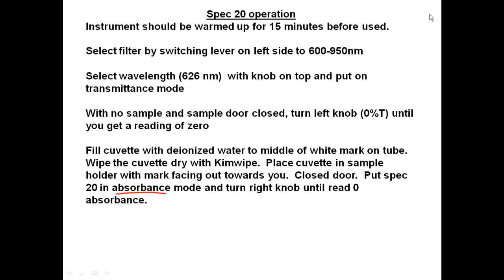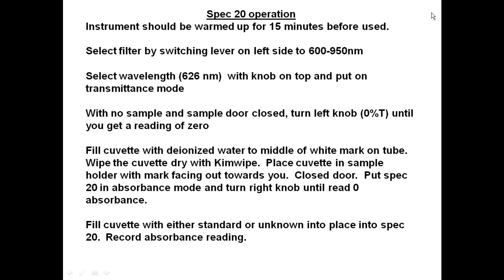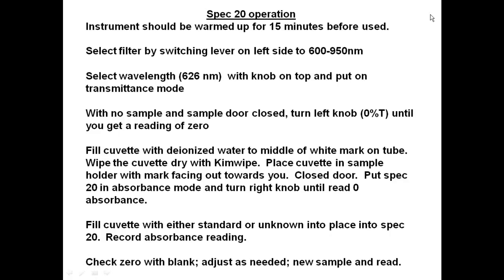Fill a cuvette with deionized water to the middle of the white mark. Wipe the cuvette, place it in the sample holder with the mark facing out, and close the door. Switch the spec 20 to absorbance mode and turn the right knob until it reads zero absorbance — meaning 100% transmittance. This calibrates the instrument for zero light and full light. Then shake your samples well, fill the other cuvette with your standard or unknown, place it in the spec 20, and record the absorbance. Check your blank between runs to ensure it still reads zero absorbance, and readjust as needed.